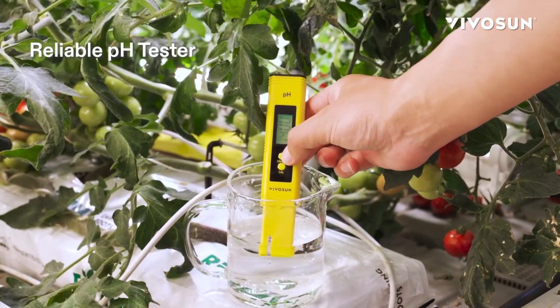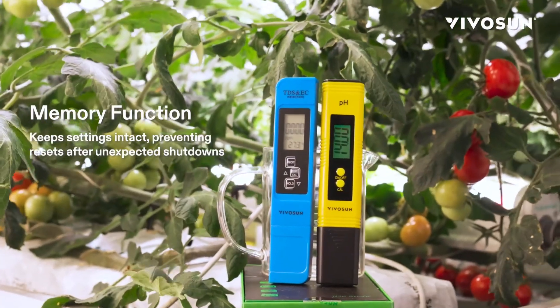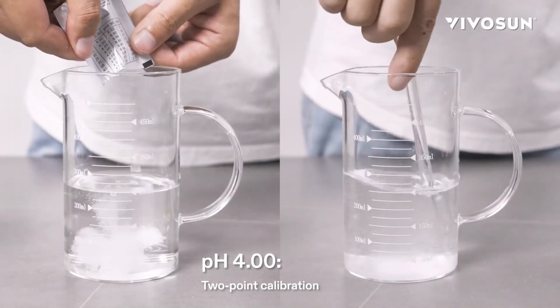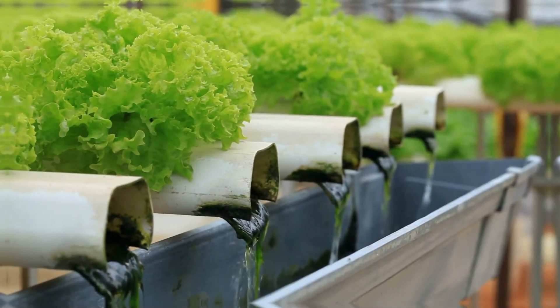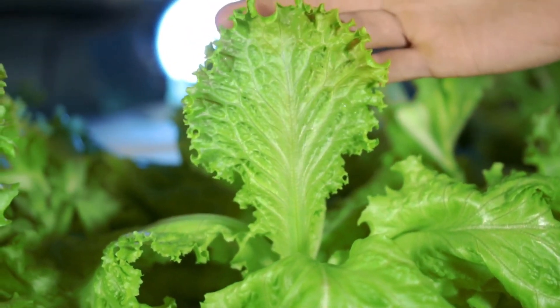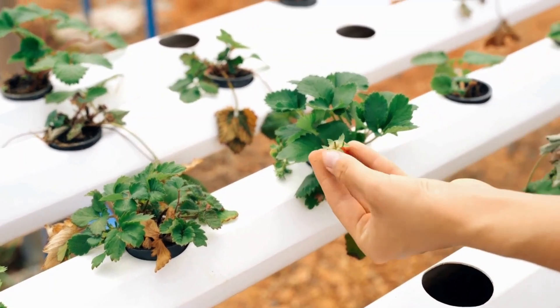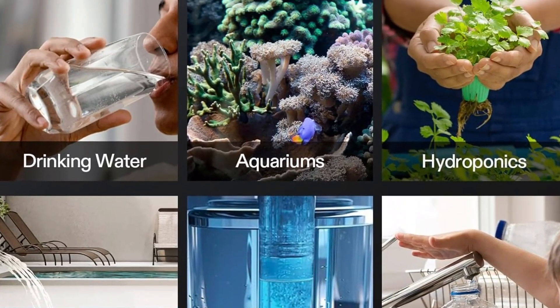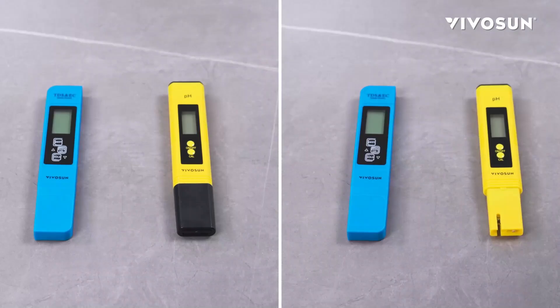First, let's talk about the digital pH meter. What does 0.01 pH high precision mean? It means you are not getting an approximate reading but an incredibly exact reading of the acidity or alkalinity of the water. This is crucial in applications like hydroponics where the ideal pH for nutrients falls in a very narrow range. An incorrect pH can block the absorption of nutrients by your plants, causing them to stagnate or even die. With this meter you will be able to adjust the pH with confidence, ensuring that your plants receive everything they need for lush growth.